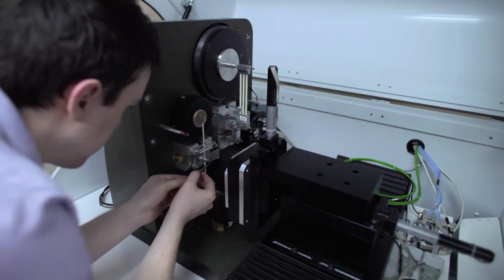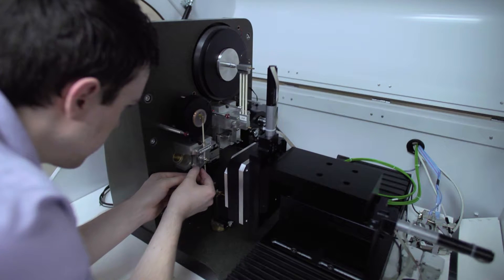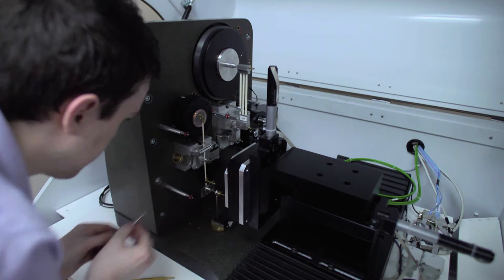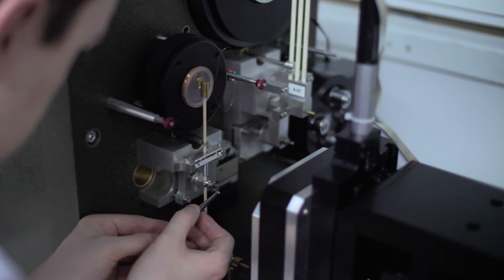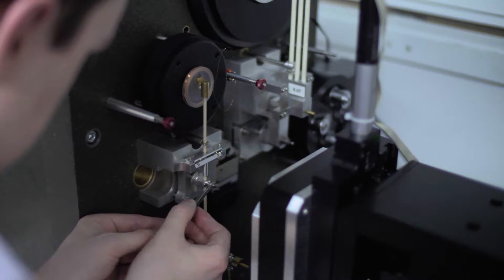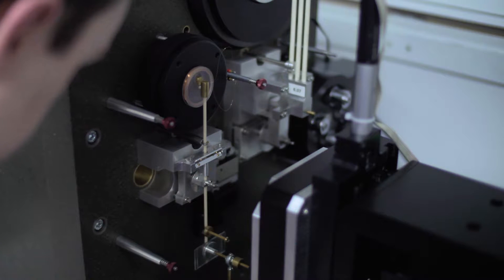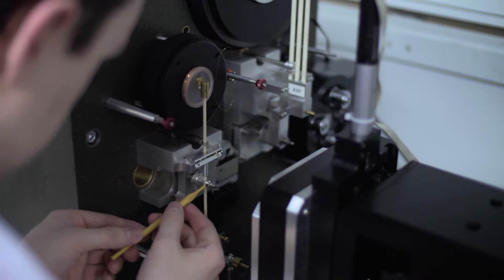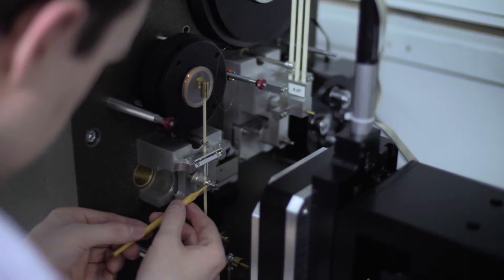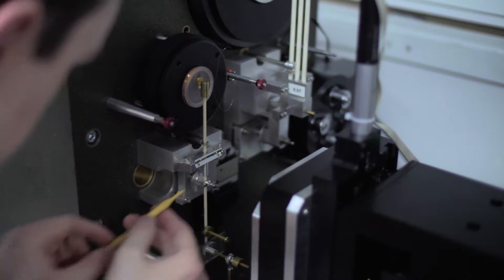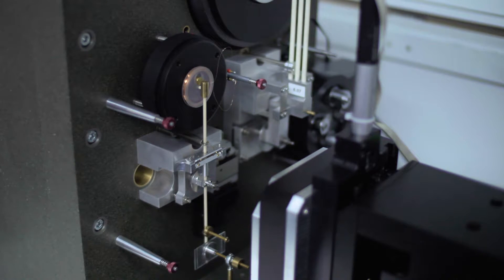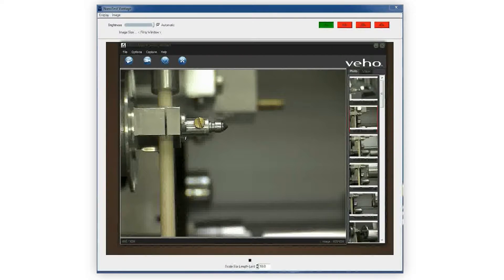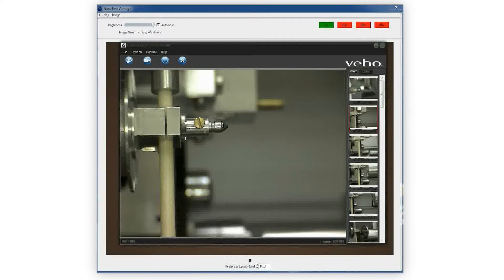The indenter cannot fall out of the loading head when the screw is loosened. Replacing the indenter is simply a case of tightening the screw once the indenter is fully inserted into the loading head. This quick procedure does not affect the load or depth calibrations, and so the instrument can be used immediately after a change of indenter.